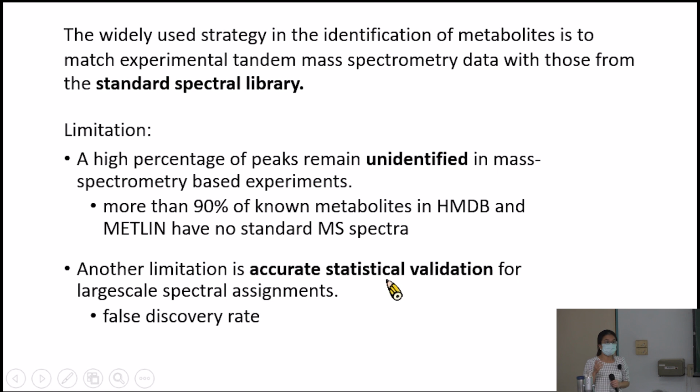When we are working on proteomics data, we usually create an artificial library. This artificial library can help us to estimate the false discovery rate, so we will know what is real and what is not. But when we are working in the metabolomics field, because metabolites are too complicated, we are unable to create a set that is available to estimate the false discovery rate. This means that we do not have a good tool to calculate what is real after annotation.